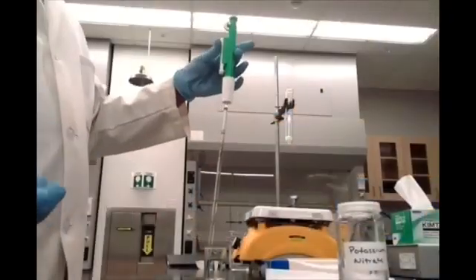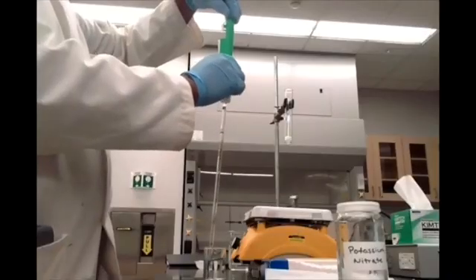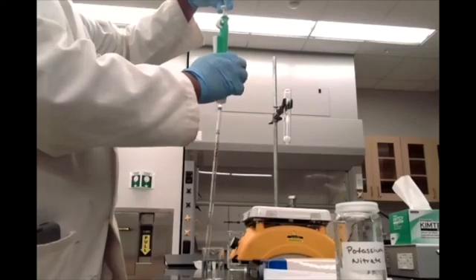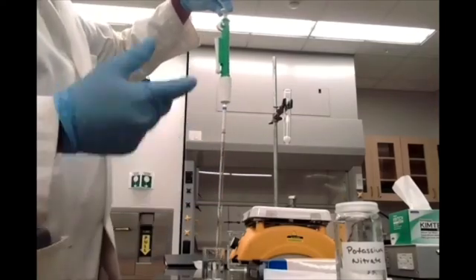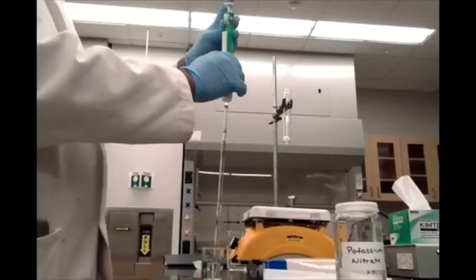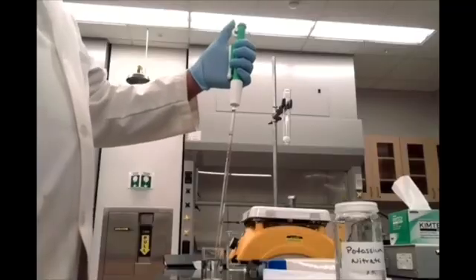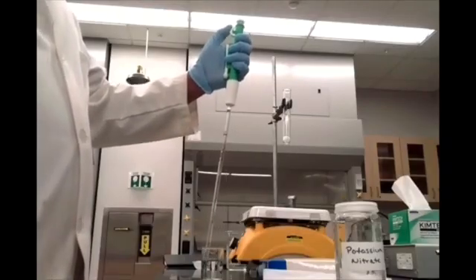You can treat your pipette bulb kind of like a syringe. You can pull up on this plunger over here, and that sucks up water into the pipette, like a syringe would. If you want a little more control, you can use this little wheel over here, which also raises the plunger of your pipette.